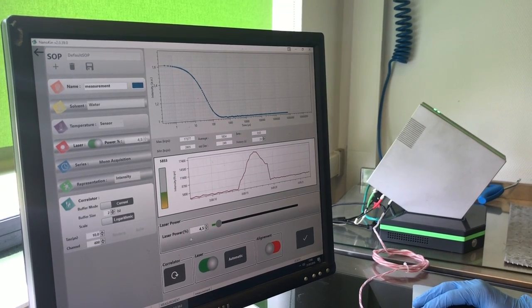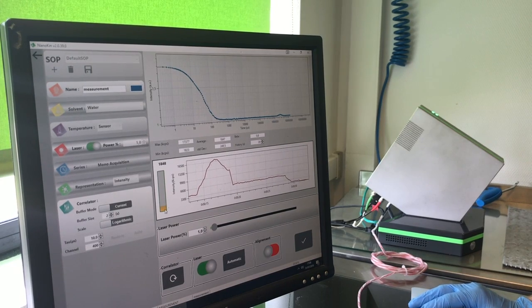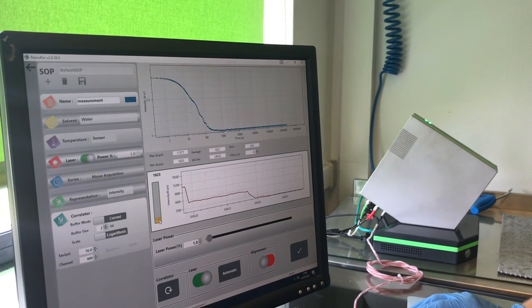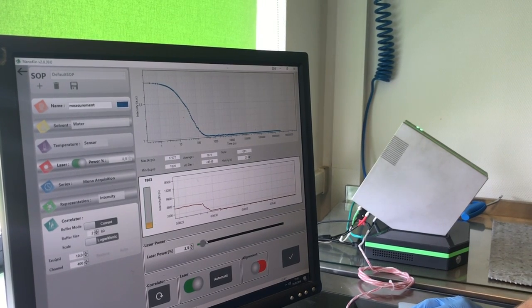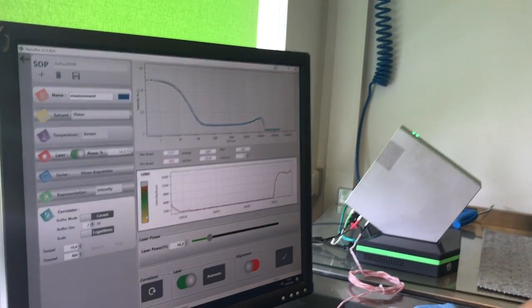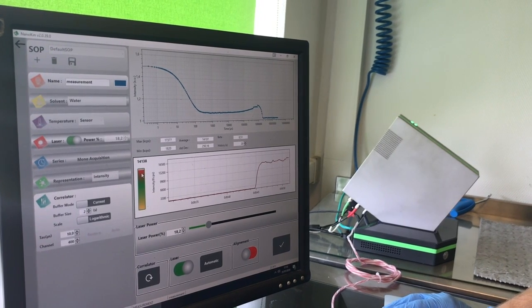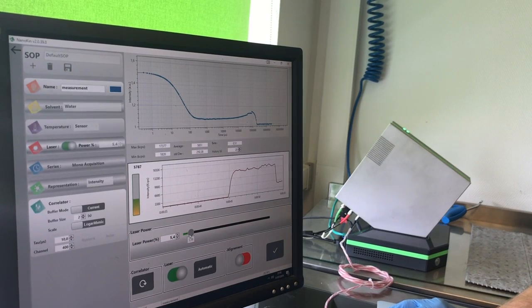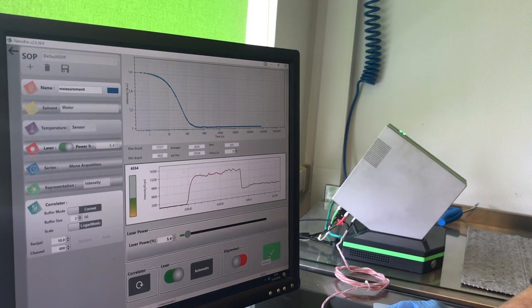You should adjust the value to be between a few kcps, which is the number of counted photons, and 10,000. In fact, you have to be in the green or the yellow area. By reaching the red area here, you take the risk of saturating the detectors. So please adjust the power of the laser beam to be in this green or yellow area, and then it's done. You can validate your setting.